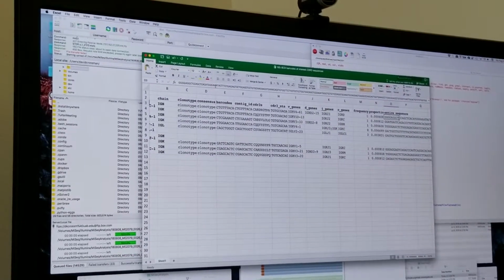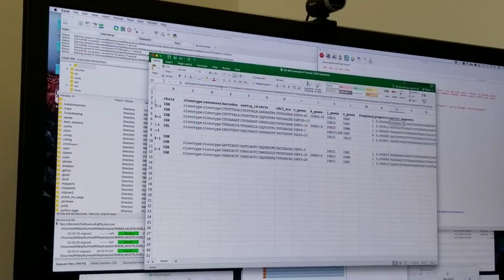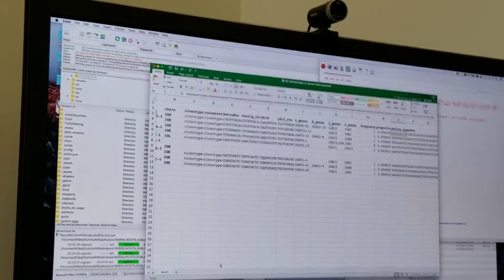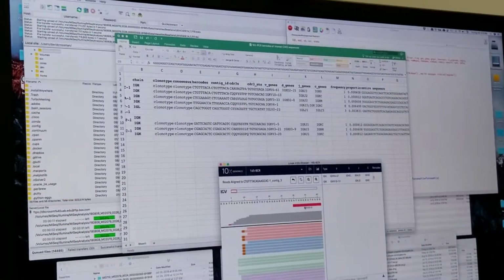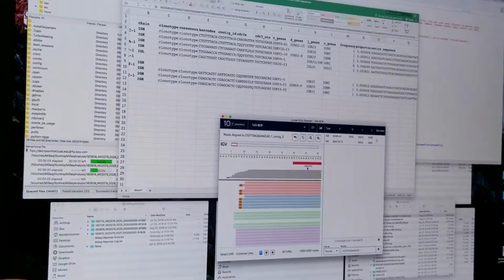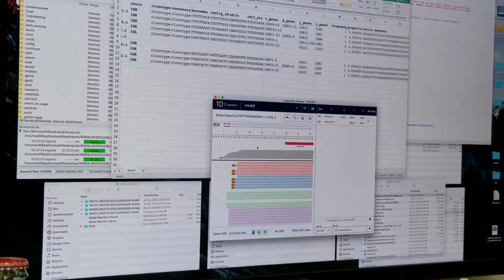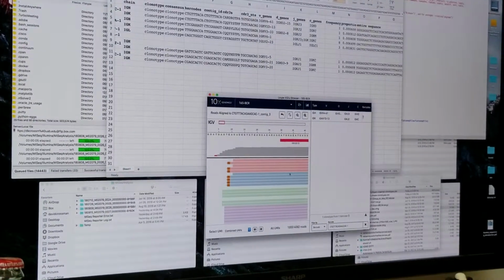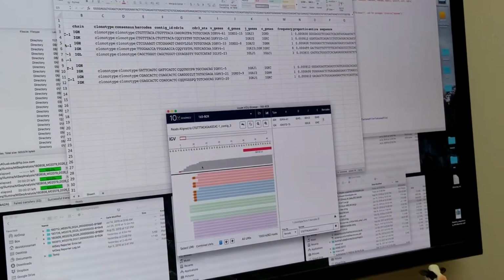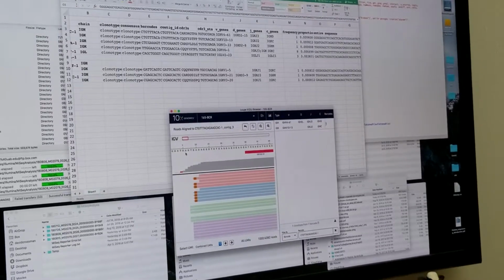Well, is the barcode missing? I mean, the barcode is not here, right? No, the barcode is not in this. So there's other stuff like 5' sequence. Right, so this is where the beginning of your IGK V1-D-13 starts, right here. Oh, I see. But these are also the reads that align to this, but they are also outside of the region. So it gives you a sense that yes, that aligned nicely. Oh yeah, and it started before. Right, and it started before.